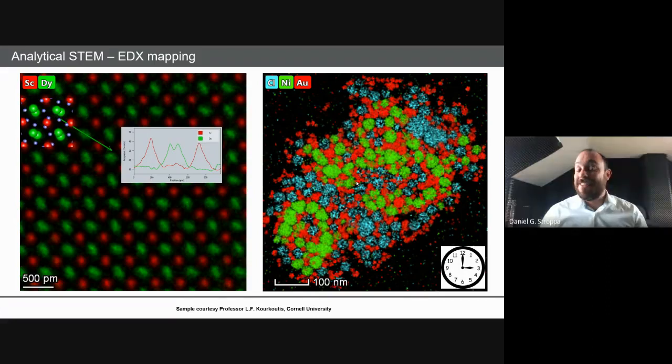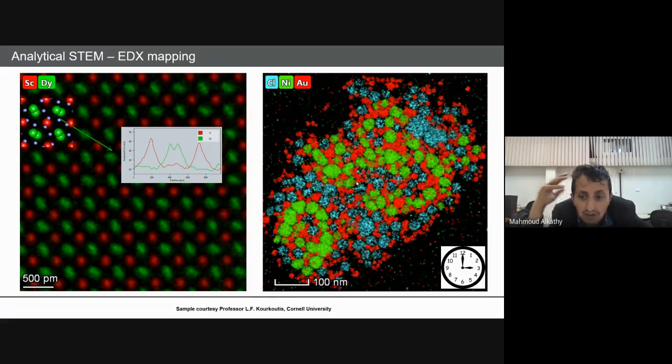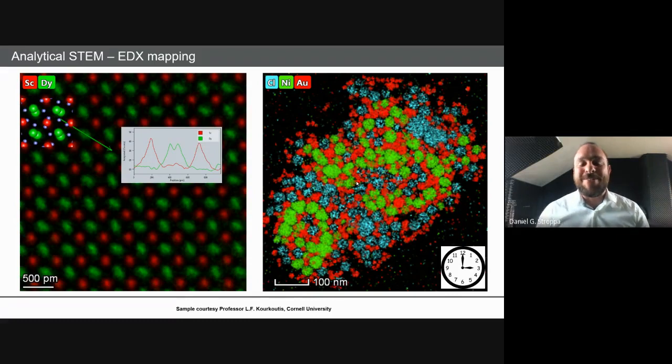And if you think in terms of scattering, what are the ways that you can try to see them? One way would be to try to see chemical events and counting, but this is not very efficient because you're going to have an error in the counting that is too large. What I try to do is to reconstruct the wave function from a series of images. And then if you're missing atoms there, you're going to have less of the phase shift as the wave goes through.